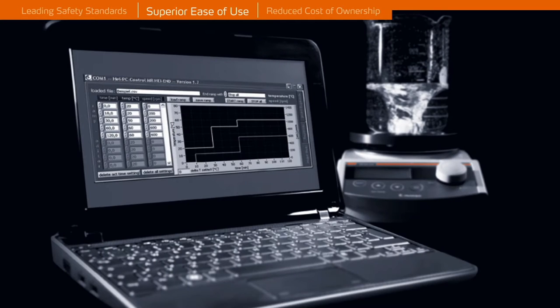An optional software program is available for the MR high-end to aid you in automating your process, and the software saves all data in electronic files.